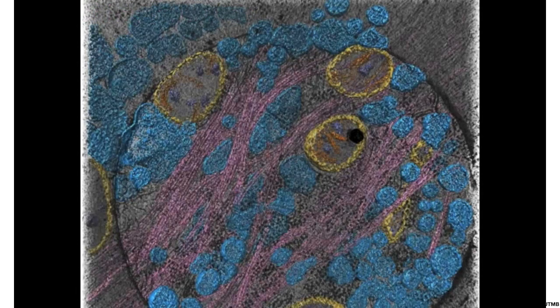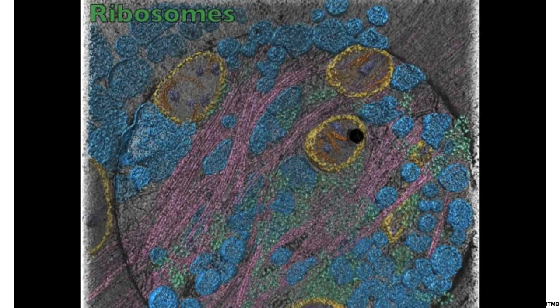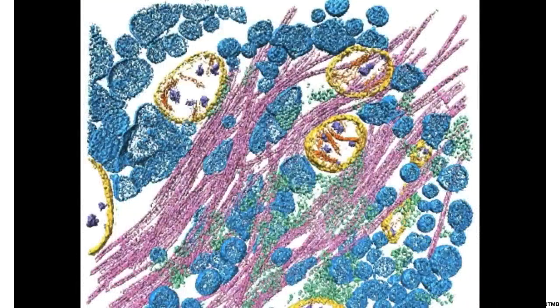These are microtubules, these are synaptic vesicles, these are ribosomes, et cetera. One tomogram easily takes a man-week of annotation time, 40 hours of someone sitting in front of the computer going slice by slice through these tomograms. So this was one of the first problems we decided to tackle in this in-situ subtomogram field.